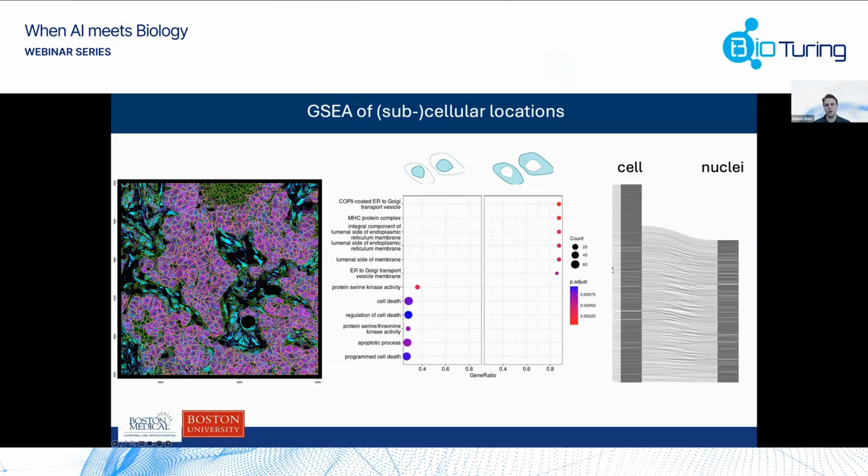So that tells you something about, if you're familiar with cell trajectories, that what is actively being transcribed is usually found in the nucleus. It's a little bit more complicated than that. So maybe this indicates that your cells are actually dying, that they are being attacked. Or maybe this is just a signal from cancer cells that there are some cell death proteins or cell death genes, but they're actually not doing anything.